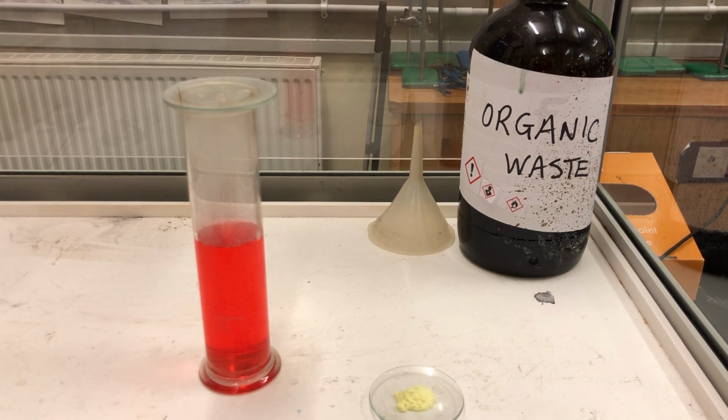When we burn fossil fuels, it makes sulfur dioxide. The sulfur dioxide goes into the atmosphere and dissolves in rain, and it falls as acid rain. Now, thankfully, the acid rain from burning sulfur is a weak acid. It's not a very, very strong acid, but it's strong enough to make us suffer from acid rain.